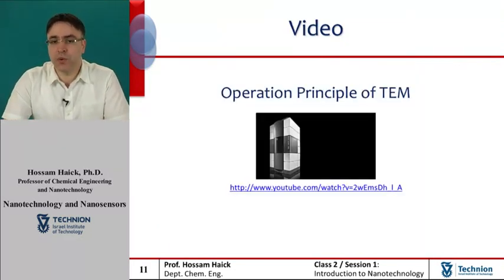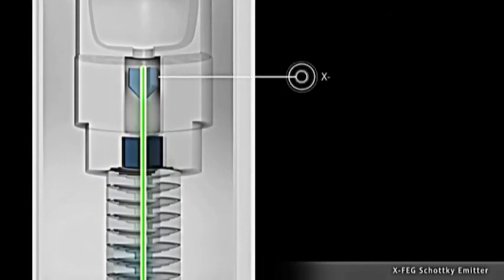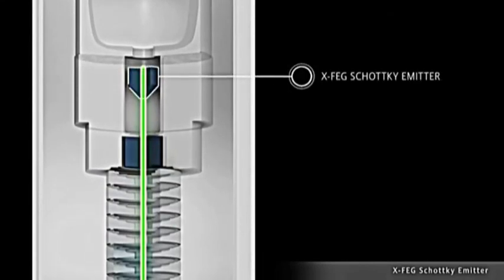In this slide, you will see a short video that demonstrates the TEM operation along with an animated presentation. Enjoy. At the top of the Titan column is the highly stable, reliable, high-brightness electron source, the XFEG Schottky emitter.